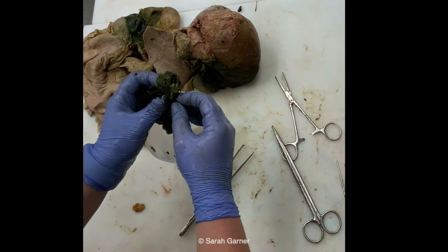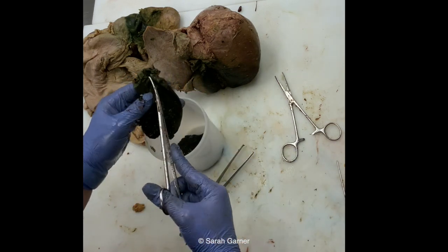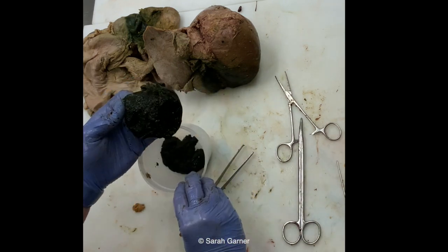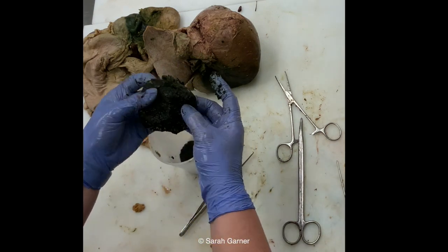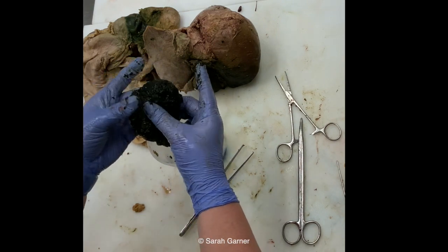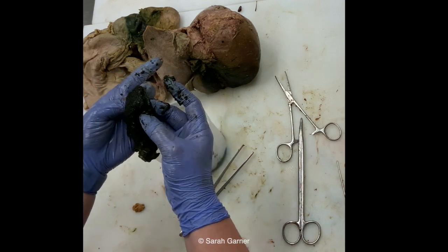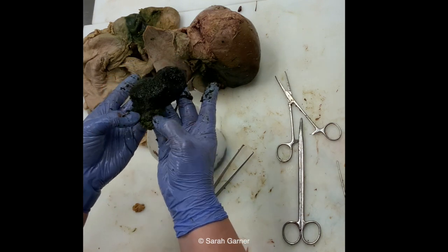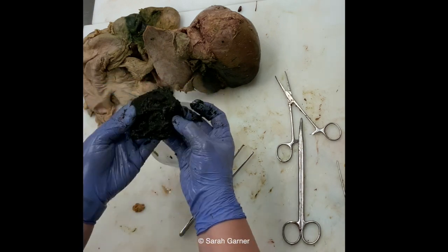Now, it is going to depend. Sometimes you'll get gallbladder sludge that is more thick and viscous, but oftentimes it's going to be a lot more runny. So you can open it up, note the consistency of the bile, note if there's any stones, and then you should be inspecting the actual mucosal surface. In this case, this one looks pretty normal. It looks green, smooth, velvety. I don't see any polyps. I don't see any lesions. I don't see any cholesterol deposits, any yellow stippling. So this looks pretty good. You would want to continue that cut up through the cystic duct, and that's kind of it for the gallbladder.